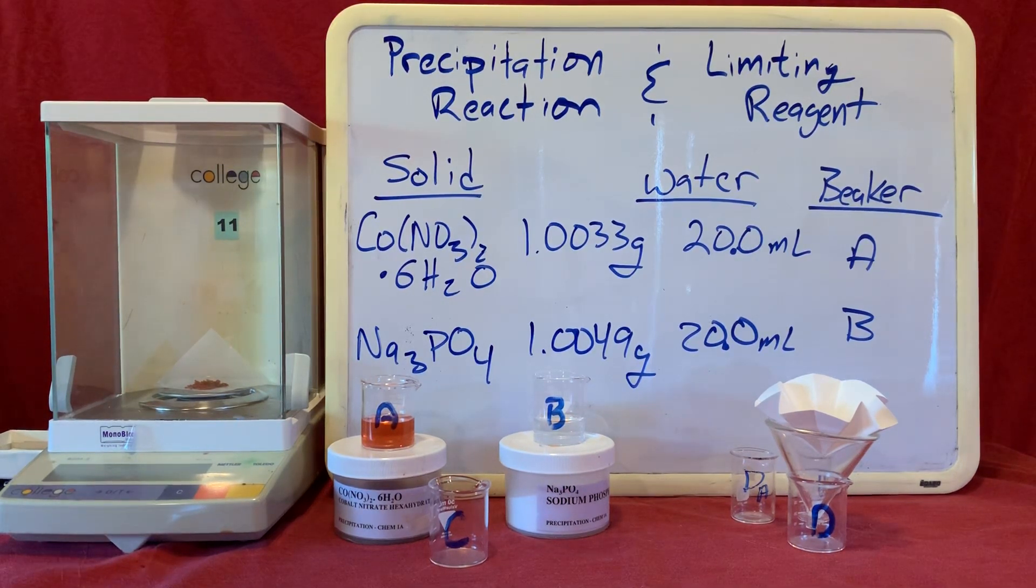In this video we'll look at part 1 of the precipitation reaction and limiting reagent lab. In this part we're going to make two solutions, solution A and solution B.